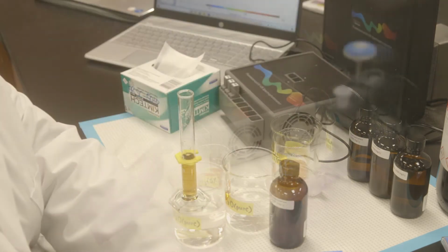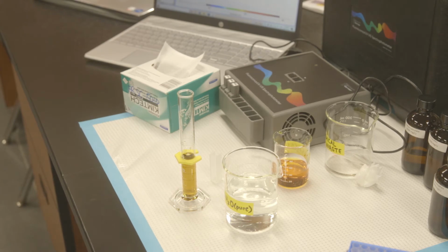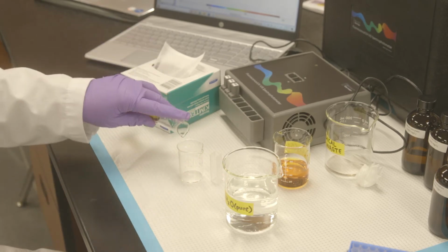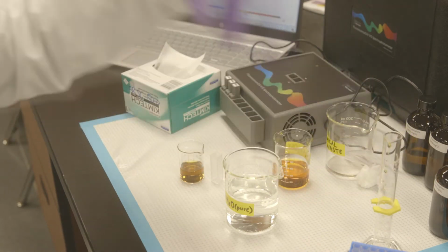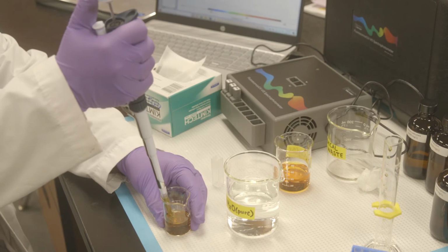For this purpose, we will mix 3 ml of each of our salicylate solutions, standards and unknowns, with 12 ml of a 5% solution of iron(III) chloride. This will create a complex of ferric and salicylate ions, which appears red-violet and results in absorbance within the range that we can measure, around 530 nanometers.